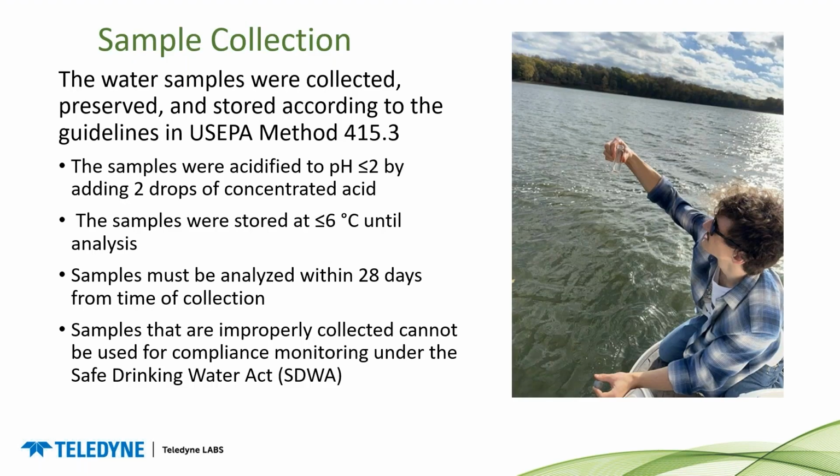The water samples were collected, preserved, and stored according to guidelines in Method 415.3.